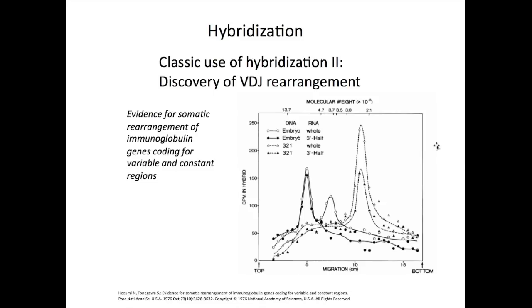So he had an RNA probe, and in the process of radiolabeling that RNA, you would occasionally get cleavage of it. So you could have a probe that would recognize only the 3' half of the antibody gene, or you could have the more intact version of the probe, which would label the whole antibody gene. And now this is at a time where one was just curious, what is the nature of these antibody genes at all?